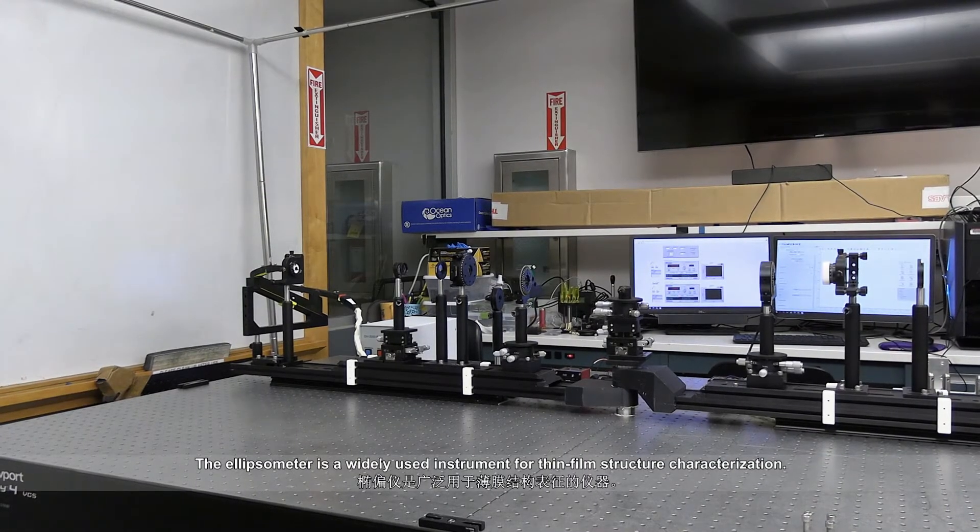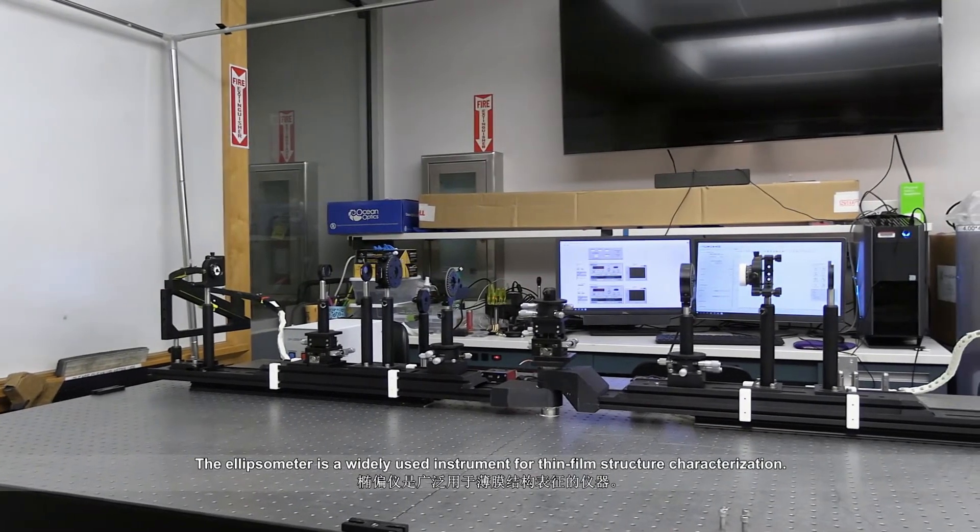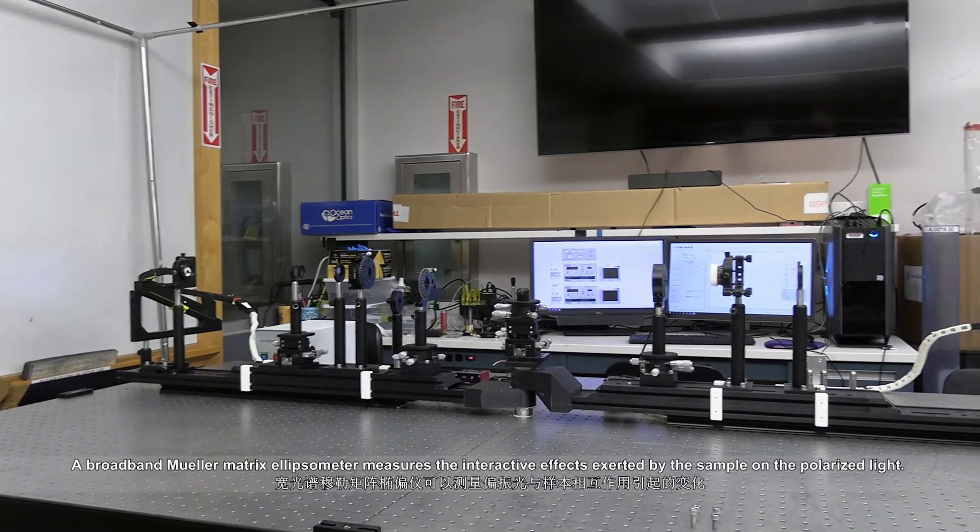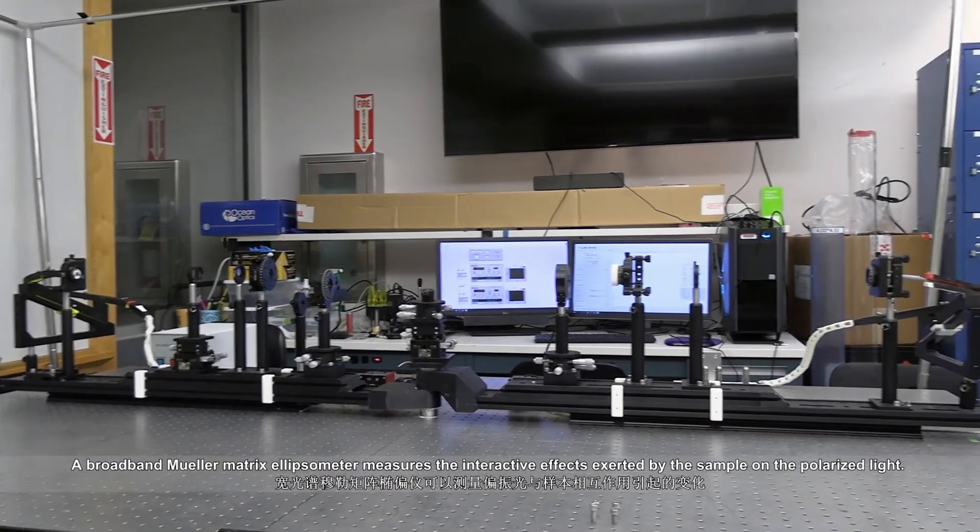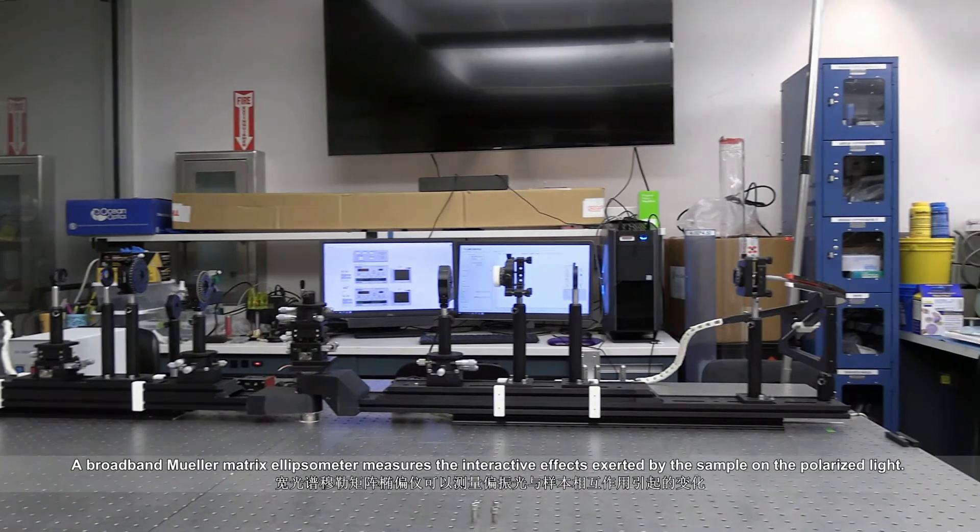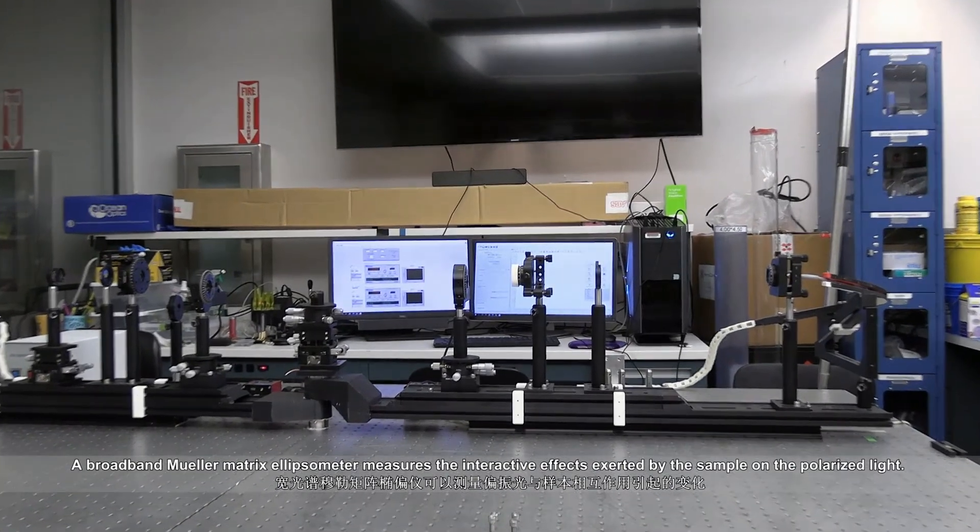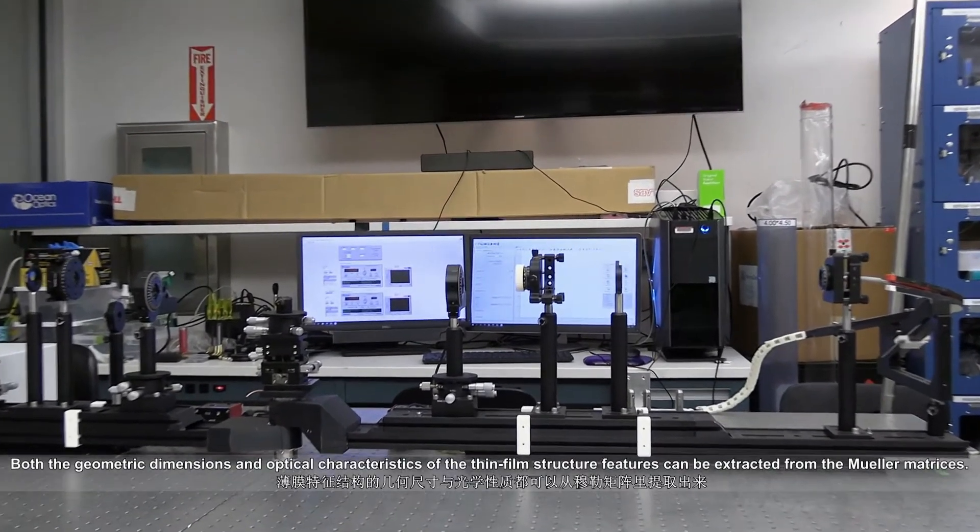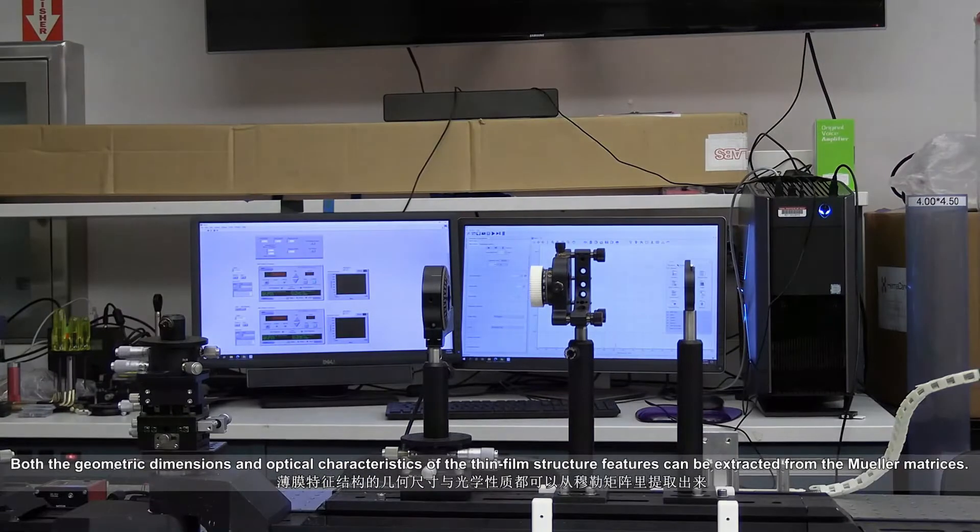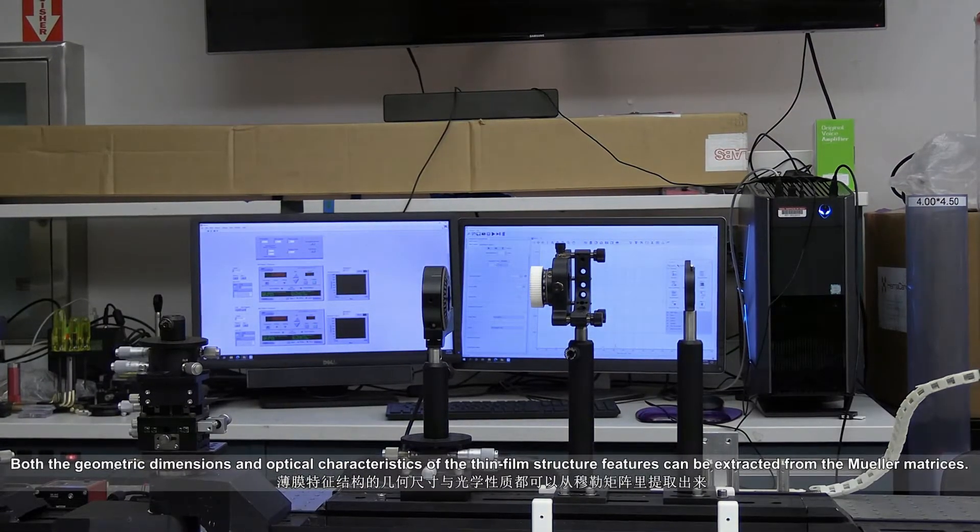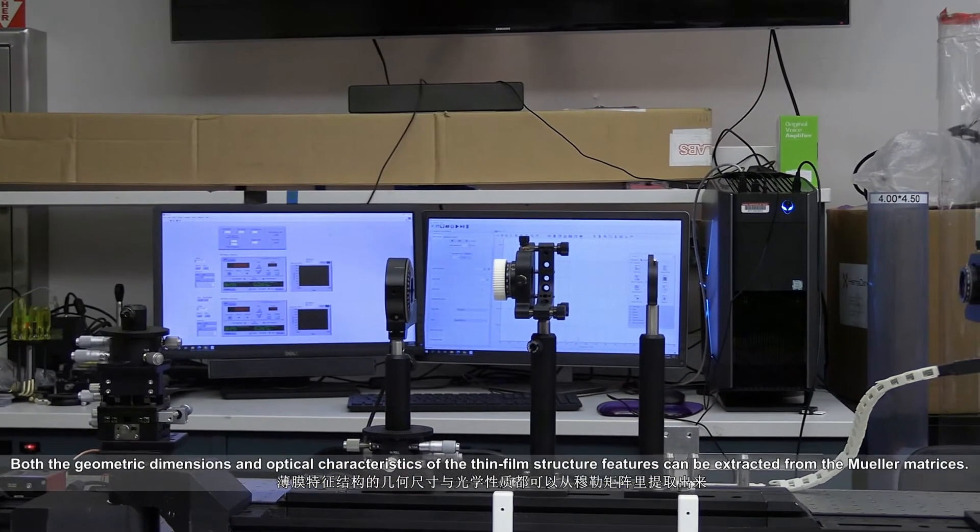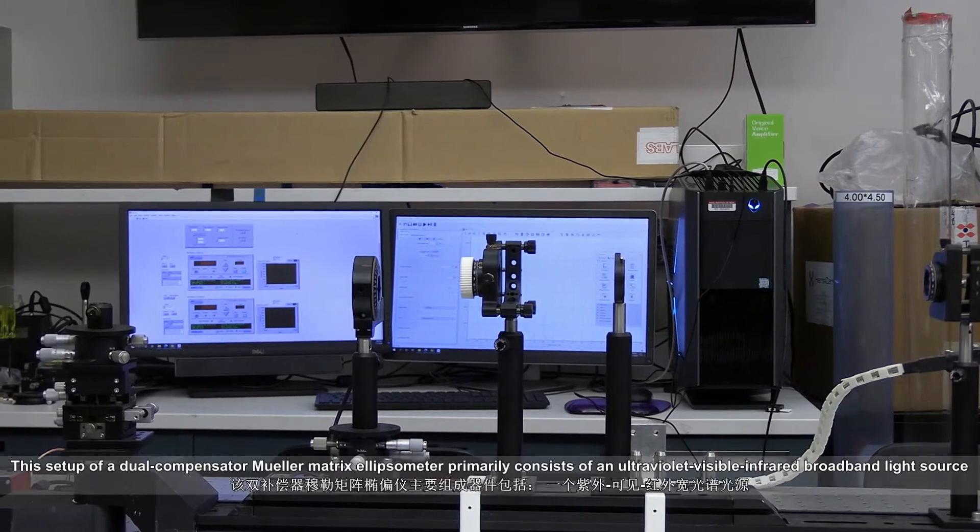The ellipsometer is a widely used instrument for thin film structure characterization. A broadband Mueller matrix ellipsometer measures the interactive effects exerted by the sample on the polarized light. Both the geometric dimensions and optical characteristics of the thin film structure features can be extracted from the Mueller matrices.